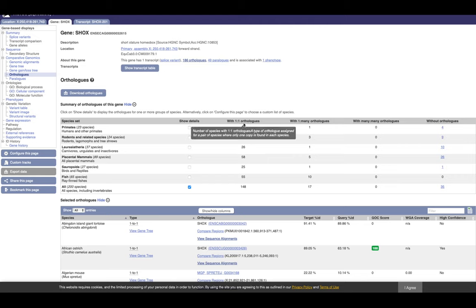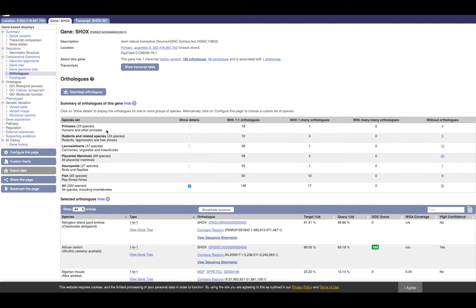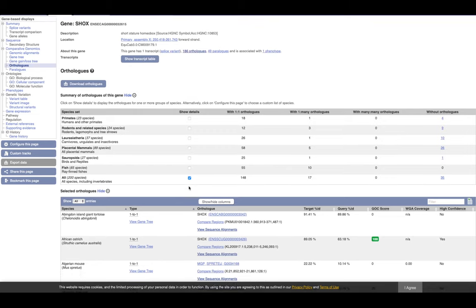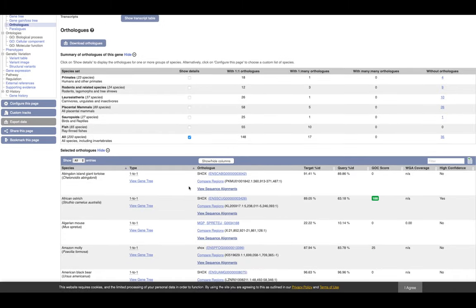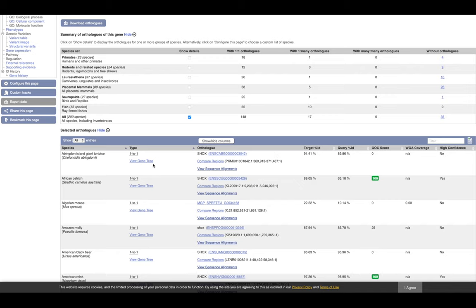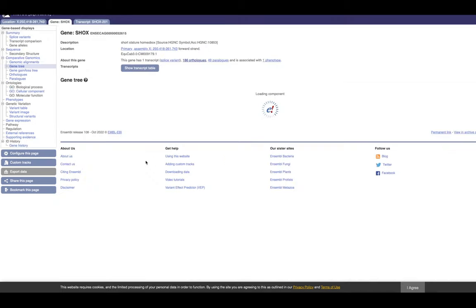It should be either one-to-one orthologs, one-to-many, many-to-many, and without orthologs. Then you can also choose different species. In this case all of the species have been selected. What you get is summarized in this table. You have species, type of orthology, orthologs, the target percentage of identity, the query percentage of identity, and some other information.